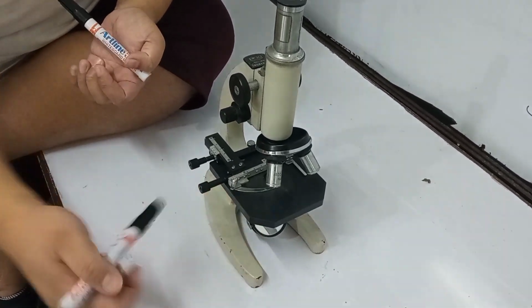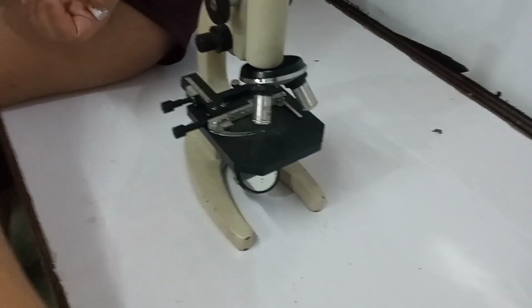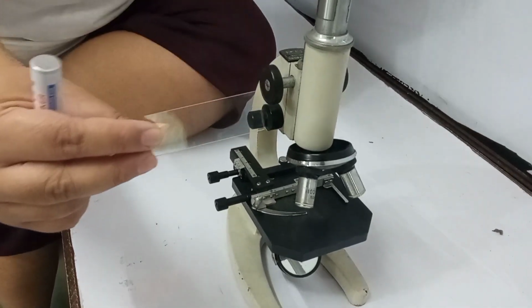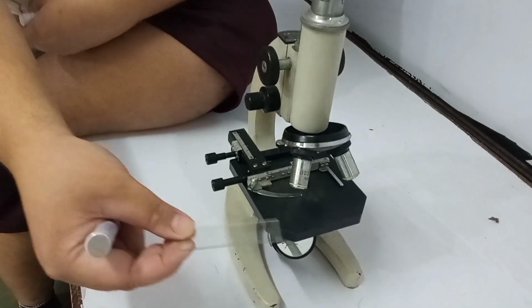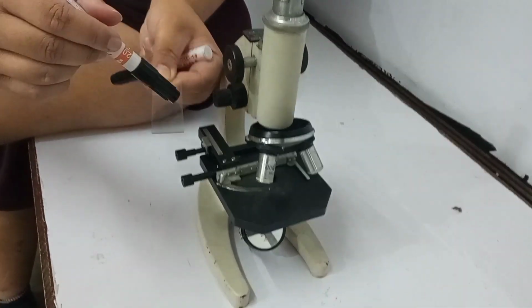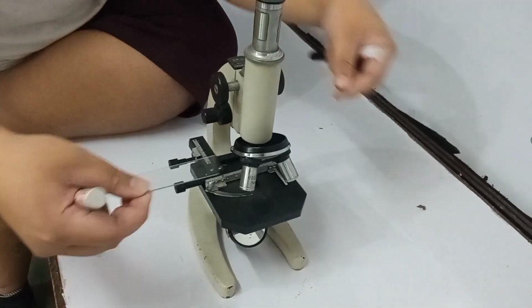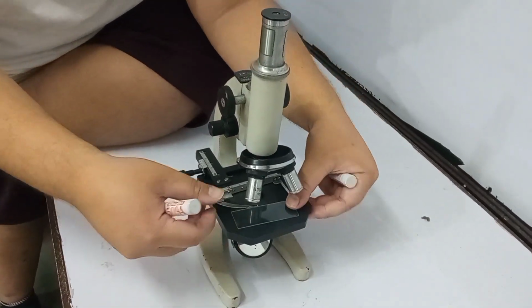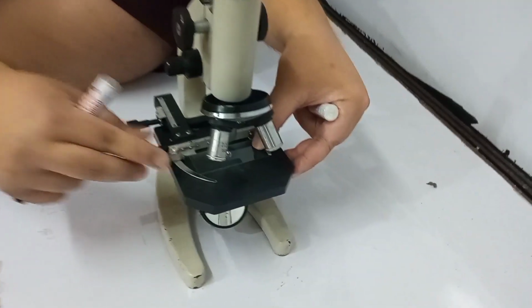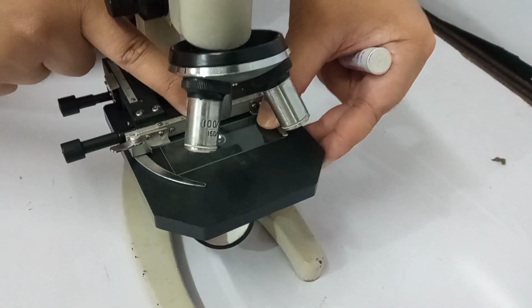Alright, let's go with the stage. Stage holds the, what is this? We call it microscope slide. Sa gitna nilalagay yung specimen. Dapat nakatapat siya sa light, dun sa loob.